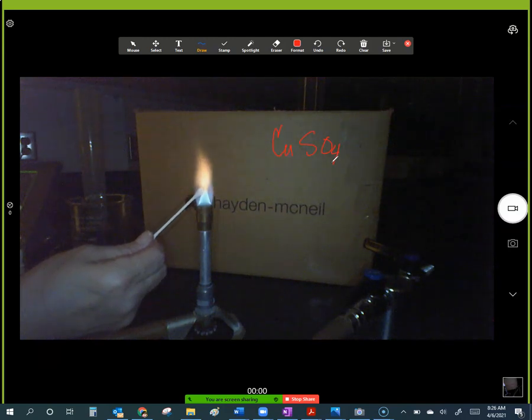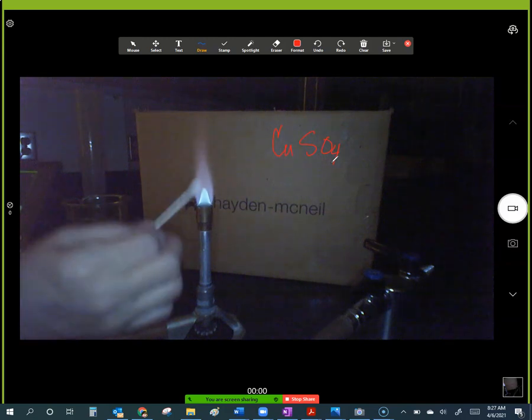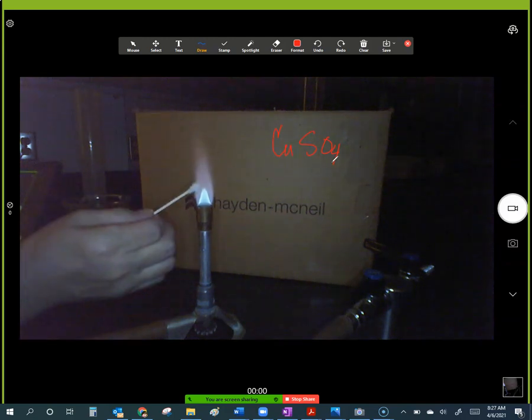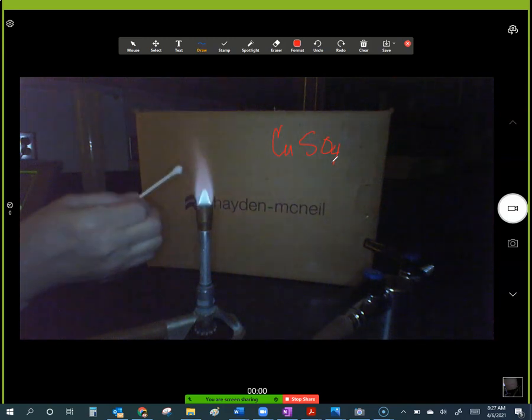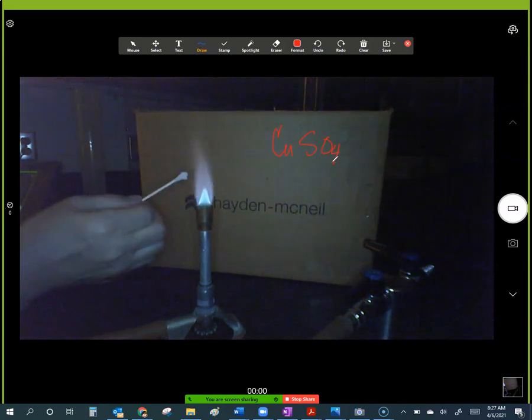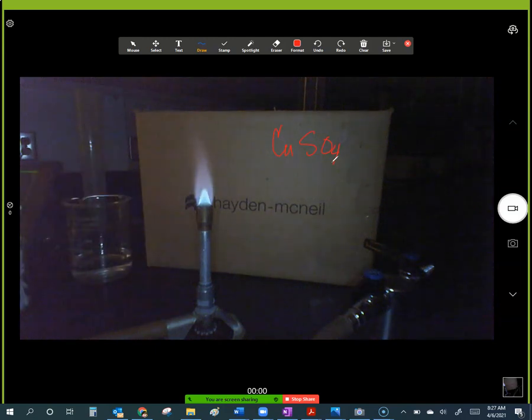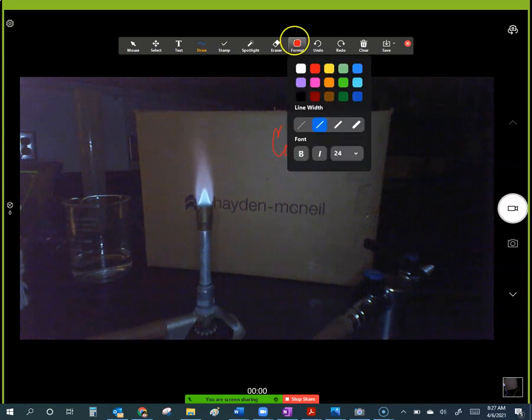From your standpoint, that looks yellow to me. I'm looking at the camera. But what I can see in here is something that the camera isn't showing, so I'm going to put a bigger chunk in there. Watch and see if you see any purple with this. Can you see any? No, you guys can't. This is still peach, but it's got some purple in it too. That was potassium chloride. I forgot to write it down.